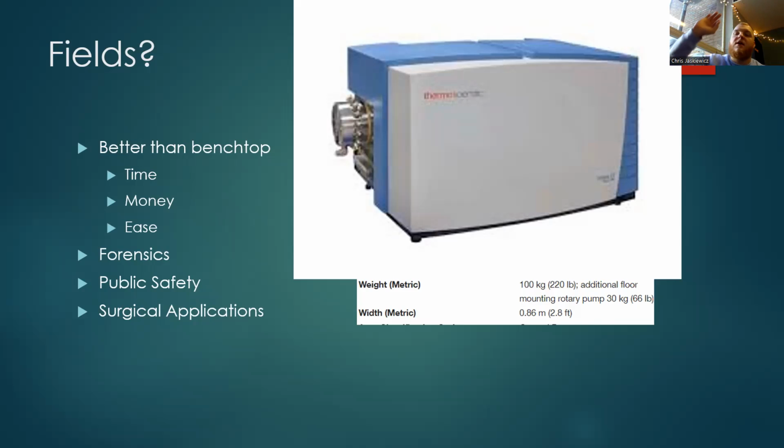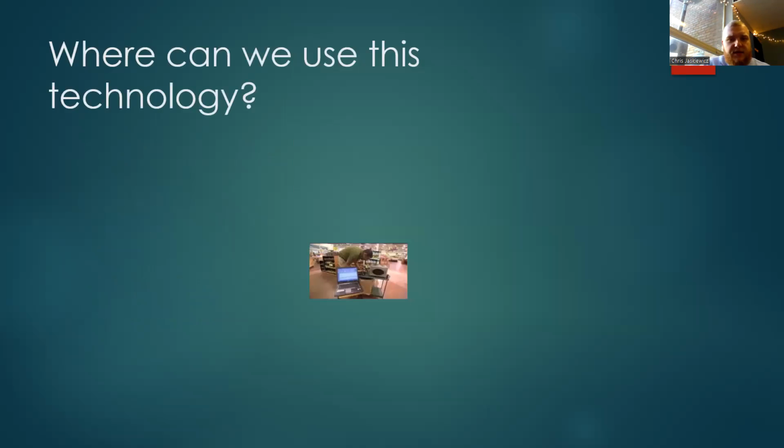So they're cutting out the tumor. Let's put ourselves in this. They're cutting out a tumor using a laser to cut around, and with that, immediately goes into a mass spectrometer analyzer, and is able to give direct feedback to that surgeon what cells he's cutting or she's cutting that are cancerous or non-cancerous, and allowing him or her to take out the minimal amount of flesh tissue as possible, right? Really, really cool stuff.